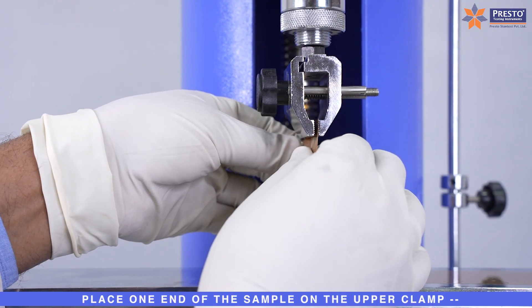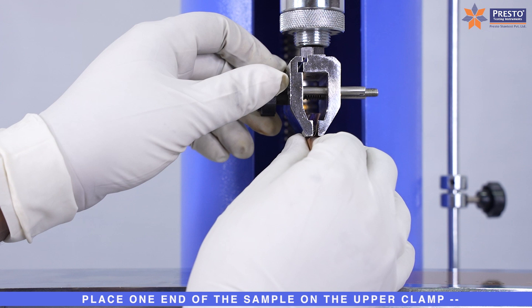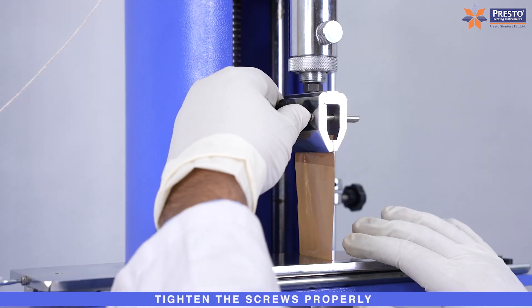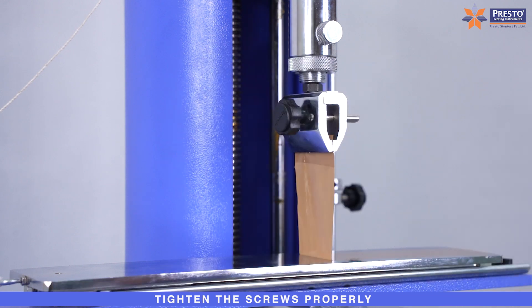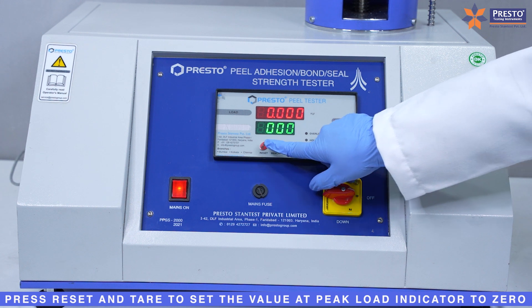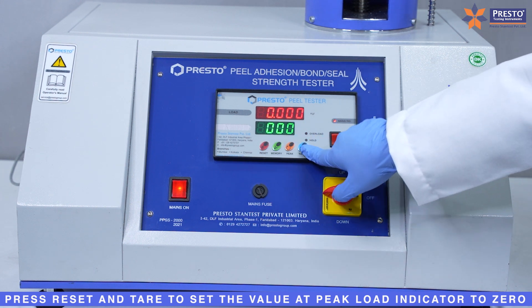Place one end of the sample on the upper clamp and tighten the screws properly. Then press Reset and Tier to set the value at the Peak Load Indicator to zero.